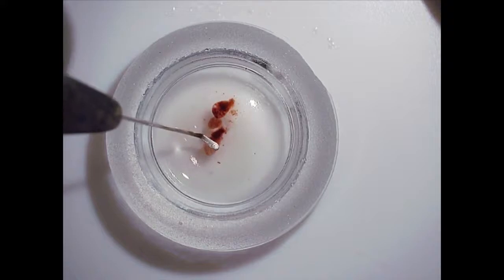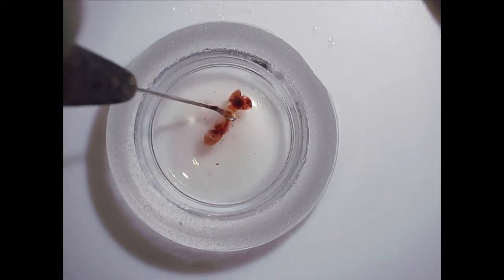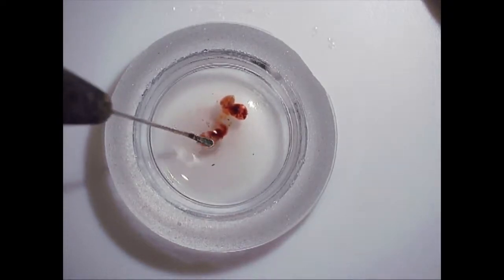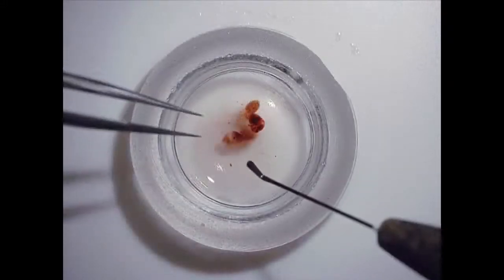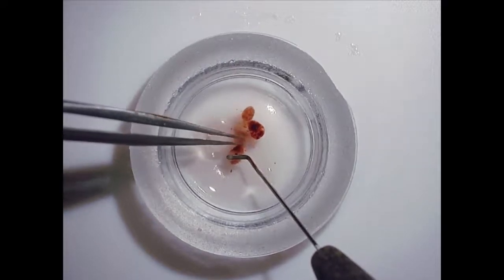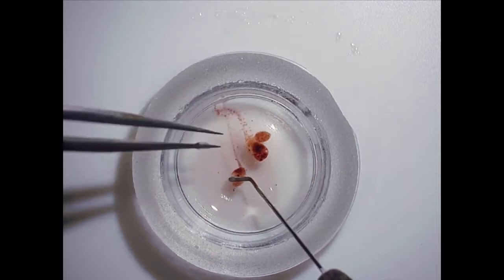And you can do this by keeping an eye on your specimen on the hot plate, removing it and doing a little bit of this at a time. Here I'm teasing again the gut contents out of the integument, just pushing down the integument. Sometimes it's helpful to come up underneath the specimen with the spatula. For difficult cases, you may have to use two tools. I'm using a fine pair of forceps, and I'm holding the scale down and just removing the fat body and eggs.